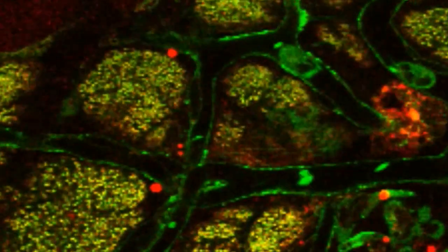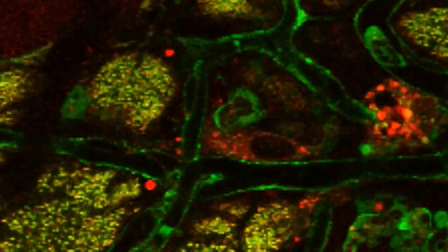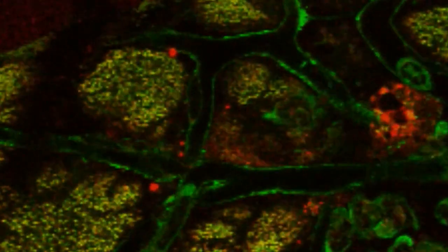In our lab, we have developed ways to image subcellular processes inside the cells of several tissues. We call this approach Intravital Subcellular Microscopy, or ISMIC.